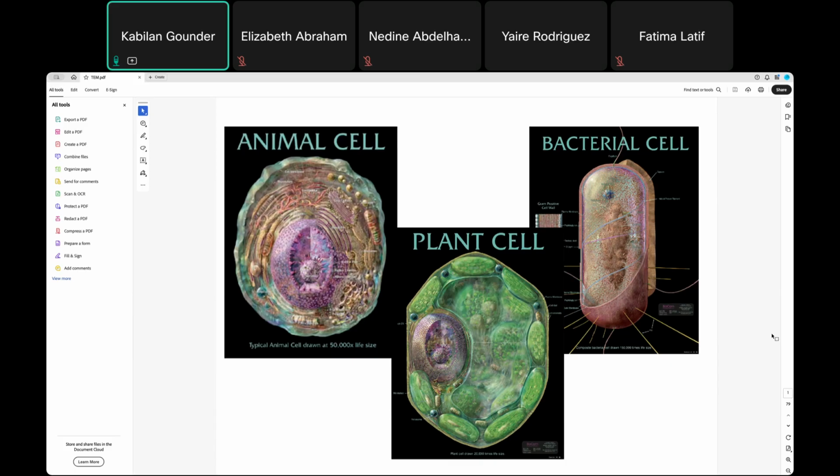In the light microscope, we get a lot of basic information for diagnostic purposes, but that is not sufficient to go into details about any given sample. That's why the electron microscope plays an important role in advanced imaging.